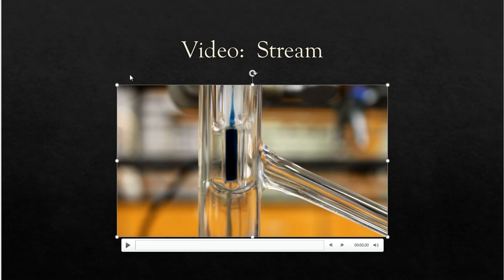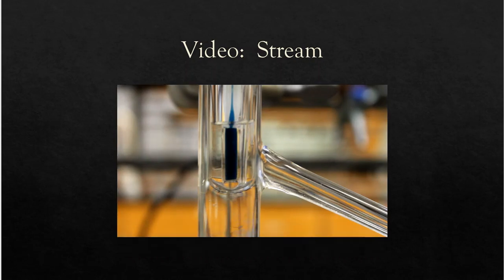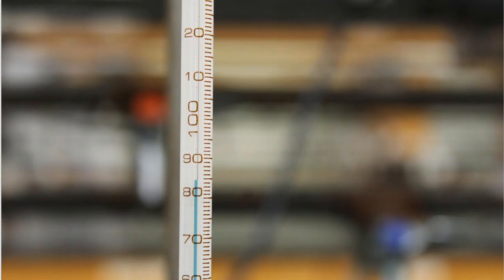All right, so as I was saying in the video, the thermometer always lags, folks. So you're going to see these bubbles. When you see these bubbles, we're clearly past the boiling point because it's boiling. But my thermometer takes a little bit of time to get up to the temperature at which it should be. So this is the reason that we say take the heat away when it begins to bubble like this, and record that temperature down.